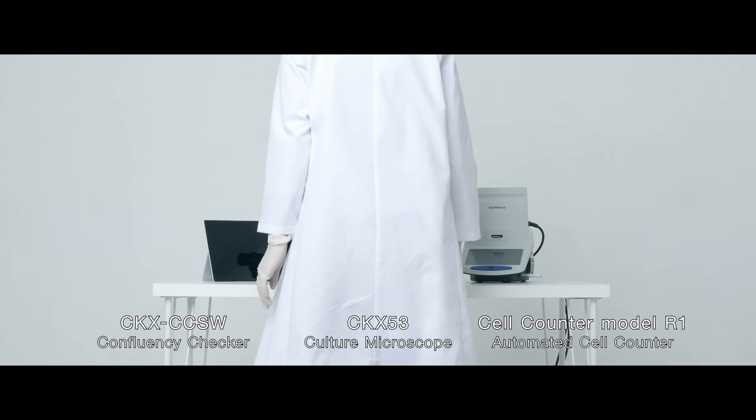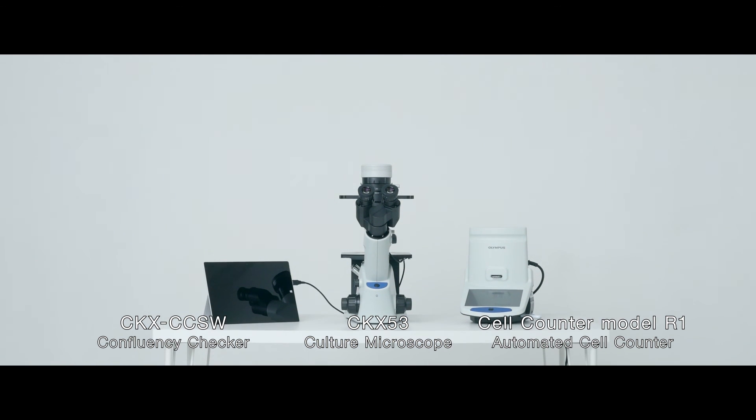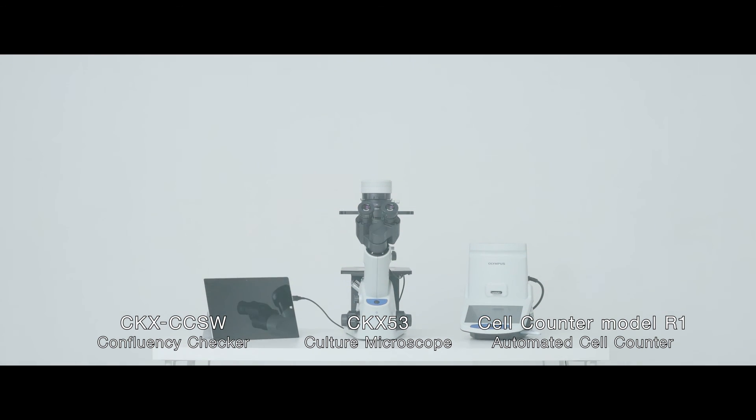The Olympus CKX53, CCSW, and Cell Counter Model R1 save time and improve accuracy for all cell culture processes.